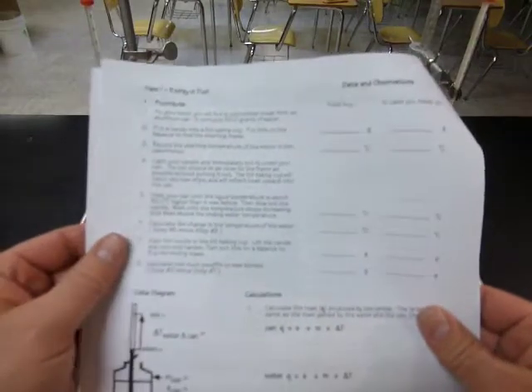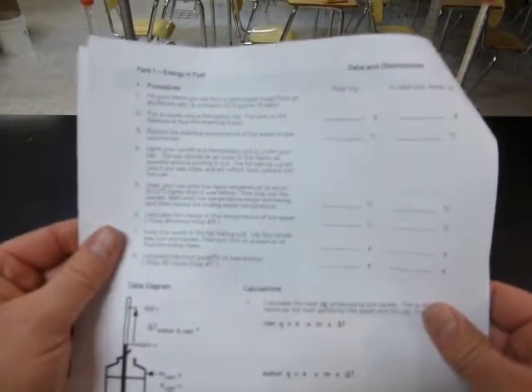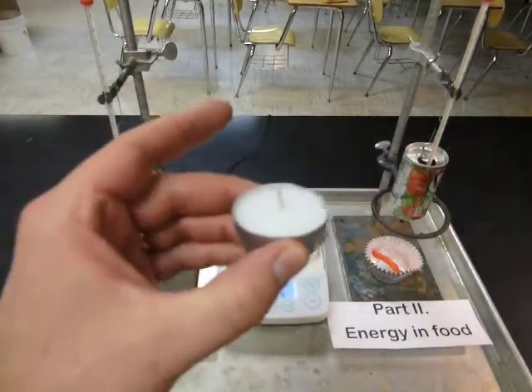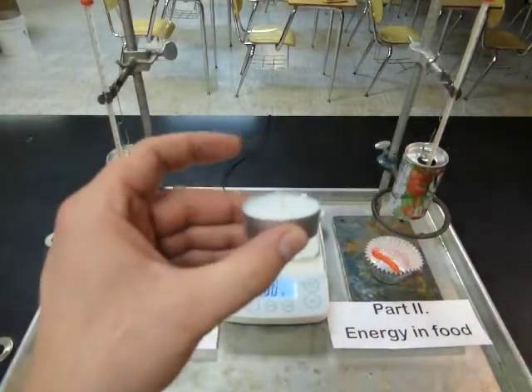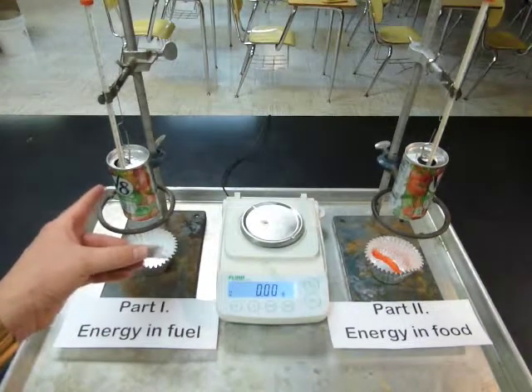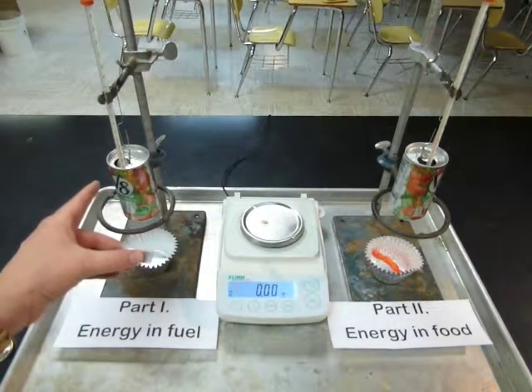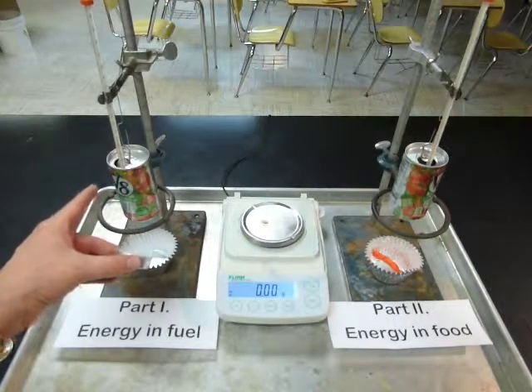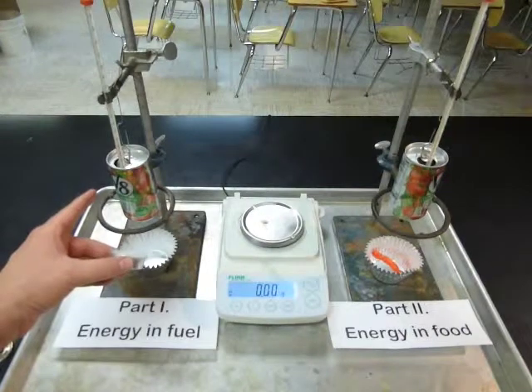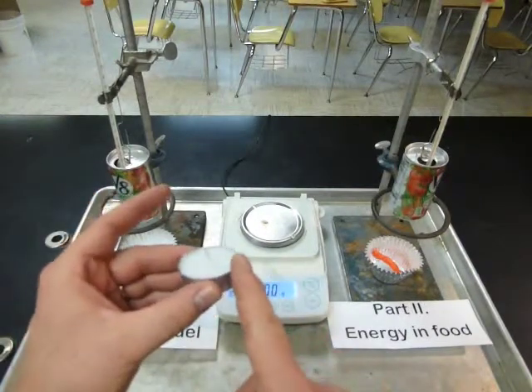Energy in Fuel. What we're going to do here is find out how much energy there is in each gram of candle paraffin, the fuel that makes candles burn. We're going to exchange heat with a calorimeter made from an open aluminum can. And then we'll use the calorimetry calculations we've used before to figure out how much heat was exchanged for each gram of material that was burned.